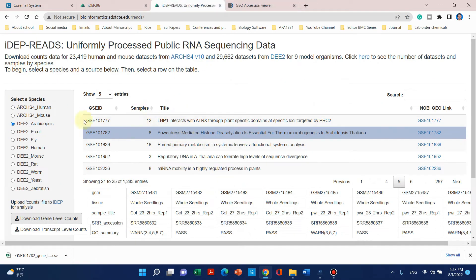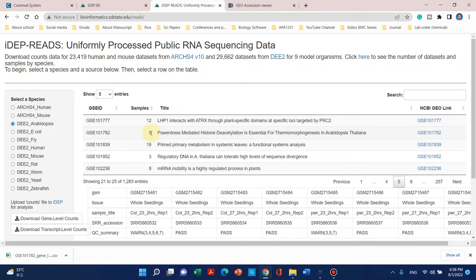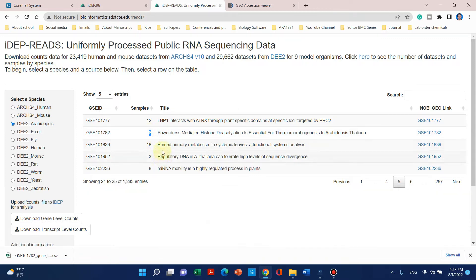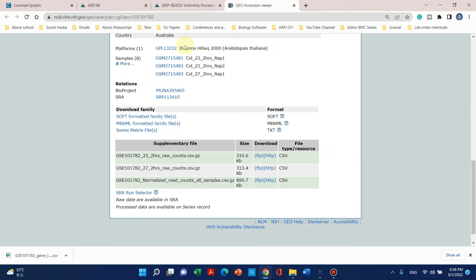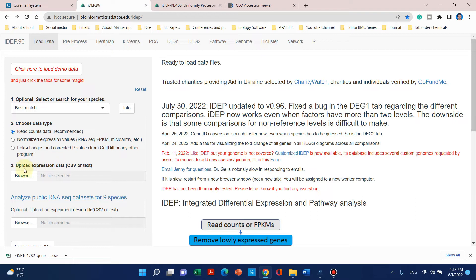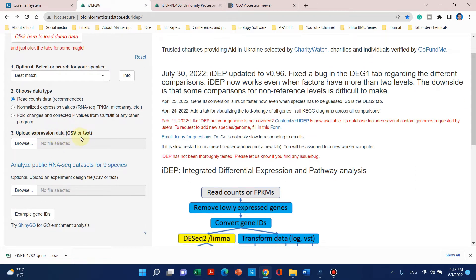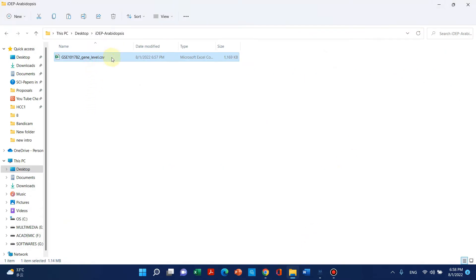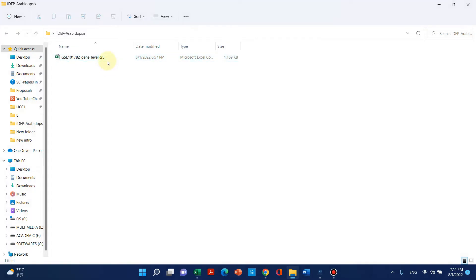When dealing with RNA-seq data where the sample number is usually more than six — here we can see there are eight samples — we need to create two things: first, the expression data in CSV format, and second, a design file also in CSV format. I will show you how to prepare both the design file and the expression file.